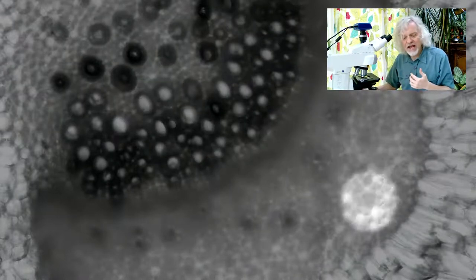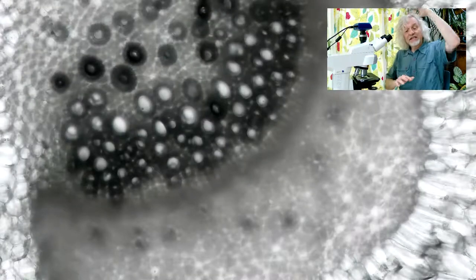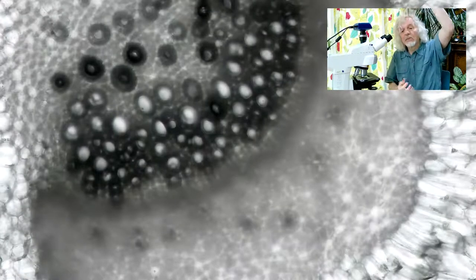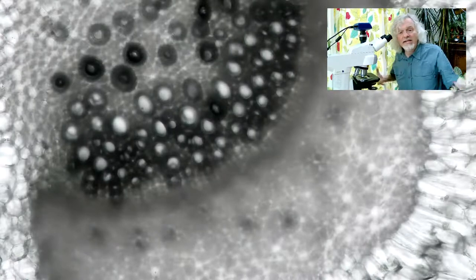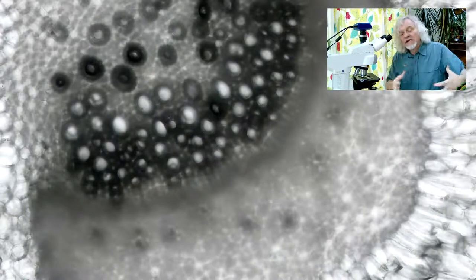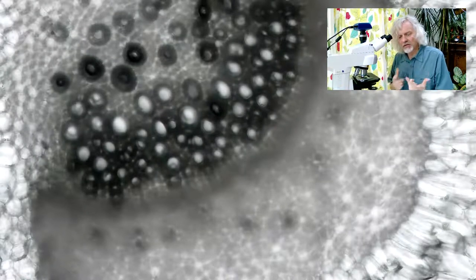But this section here, this section is the phloem section. And the phloem makes up a series of essentially tubes, although they're not sort of just like hose pipes. They're living cells. And what they do is they take the sugars that the leaves make, and they pass them sort of cell by cell, hand over hand, back down to all the rest. And they distribute it to all the rest of the plant. Because obviously, the food the plant needs is made in the leaves. But that food needs to get all the way down to the roots and to everywhere in between. So those are the two main bits.